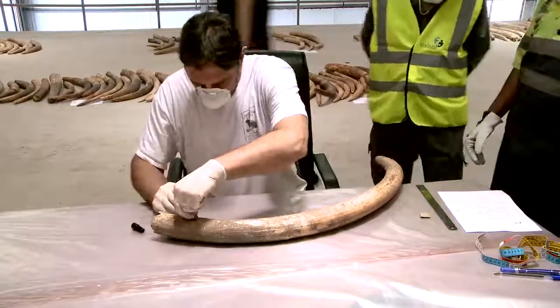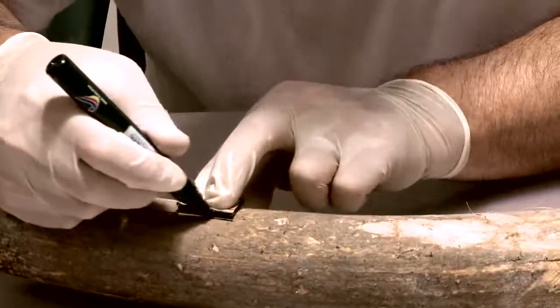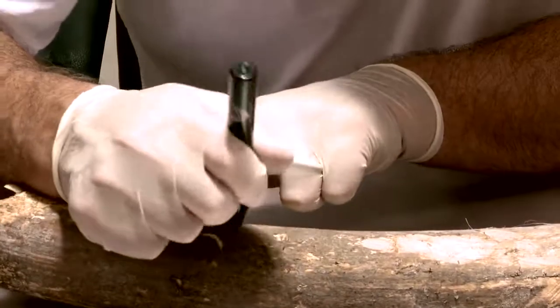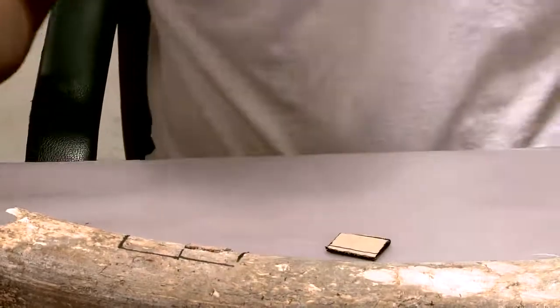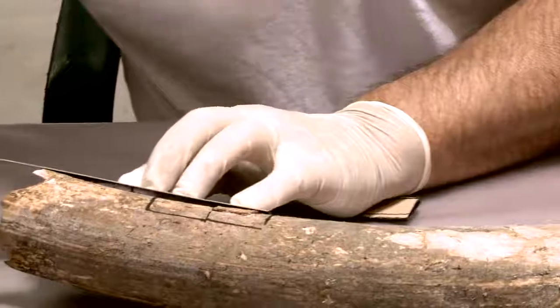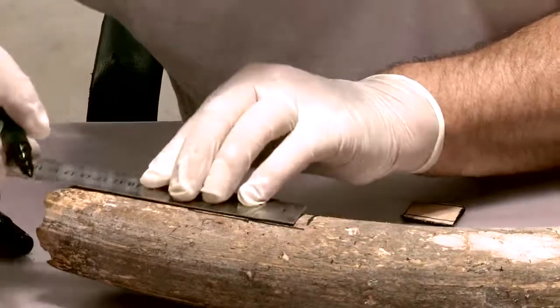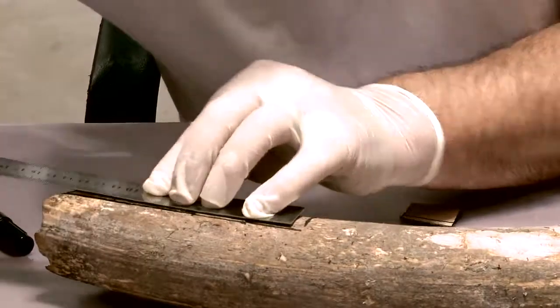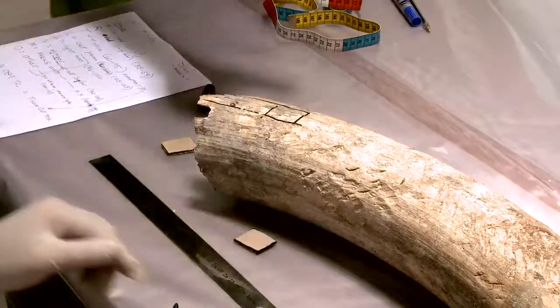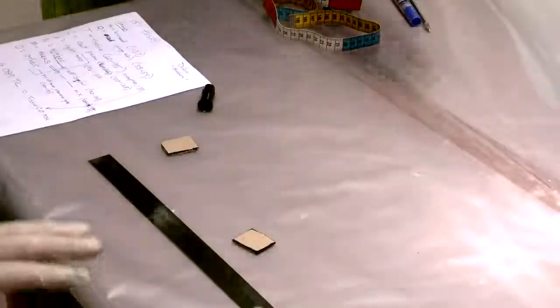Ivory is tested for origin and age by measuring its DNA and isotopes. Both analyses work best when the cut samples are at least 0.5 centimeters thick. To achieve that thickness, samples may need to be cut several centimeters from the base of the tusk, because the end of the base may be too thin. Each cut piece should measure approximately 3 centimeters by 3 centimeters and 0.5 to 1 centimeter thick.